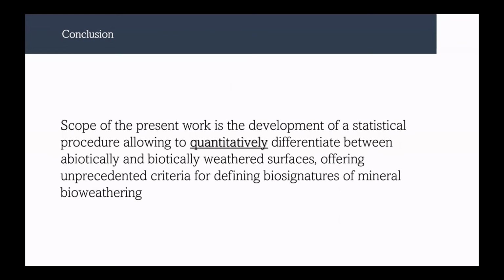And just to conclude, the idea overall of this work is to develop some statistical techniques that are able to distinguish quantitatively between weathered surfaces and bioweathered surfaces, based on the acquisition of surface microtopography data after dissolution.